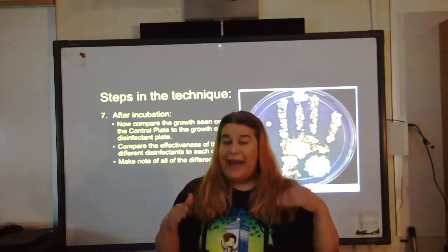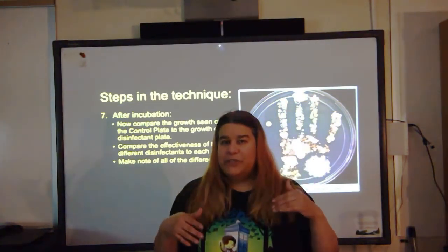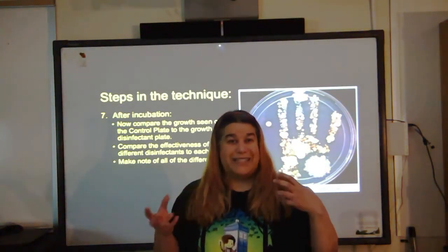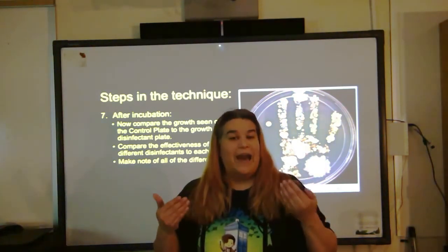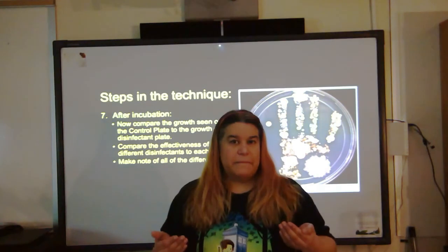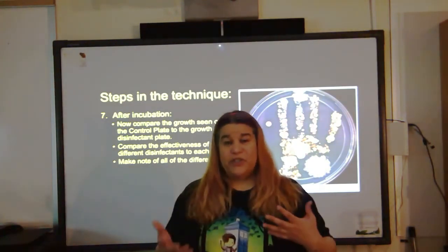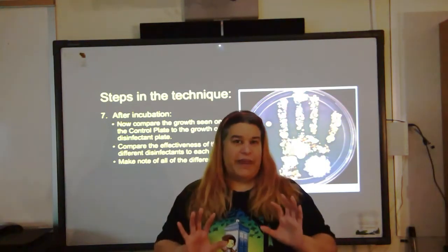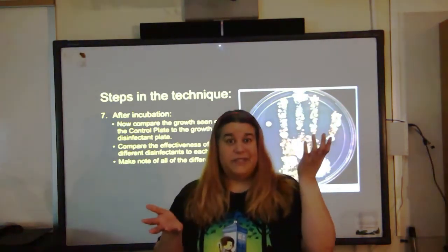If you think back to lecture, one of the things that we mentioned with alcohol as far as its effectiveness, what impedes its effectiveness, was how fast it evaporates. Alcohol evaporates super quick. And if it evaporates so quick that it doesn't sit on the bacteria long enough to be effective, how effective is it going to be?